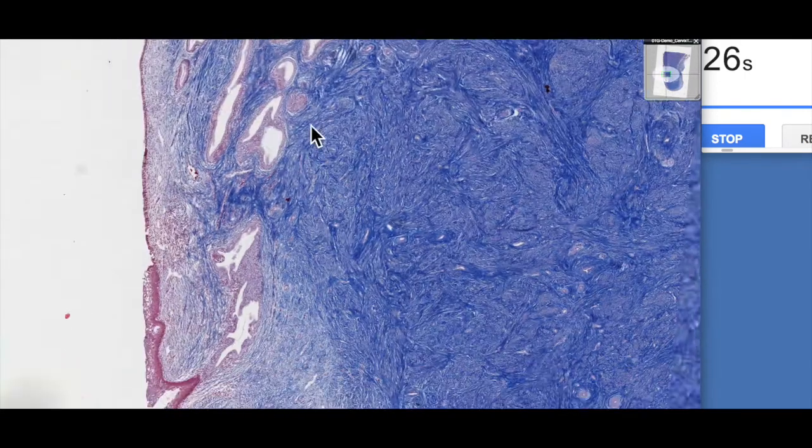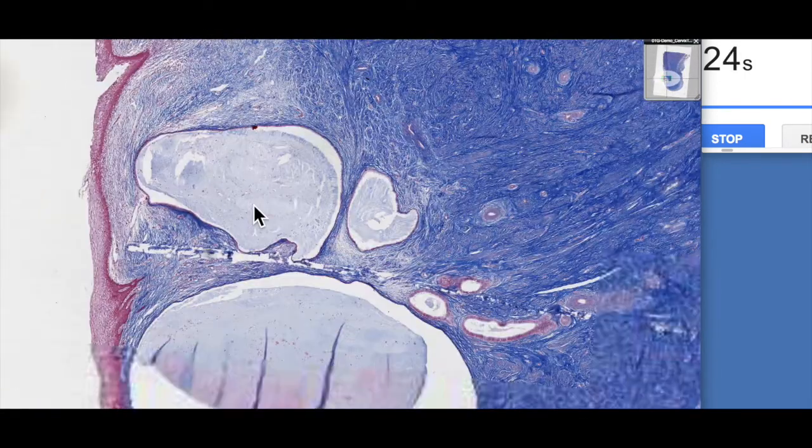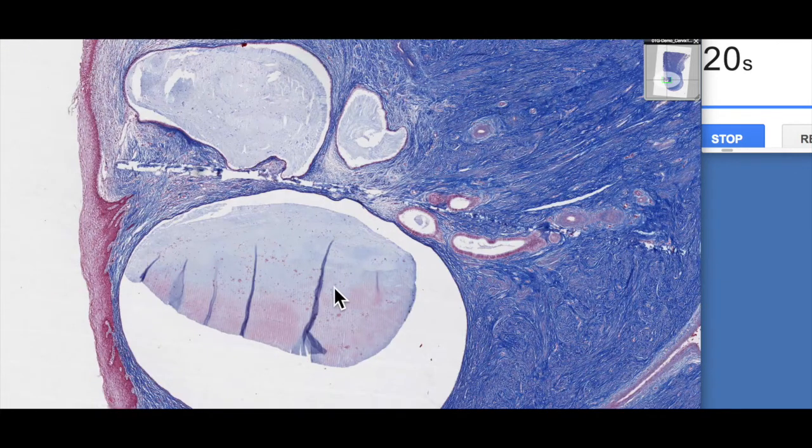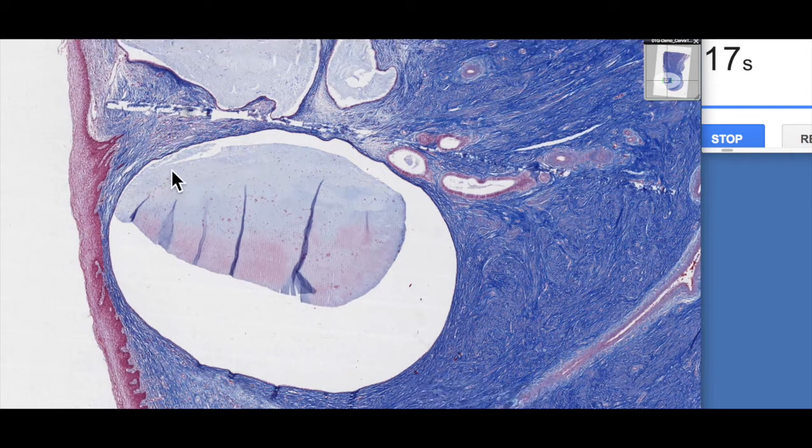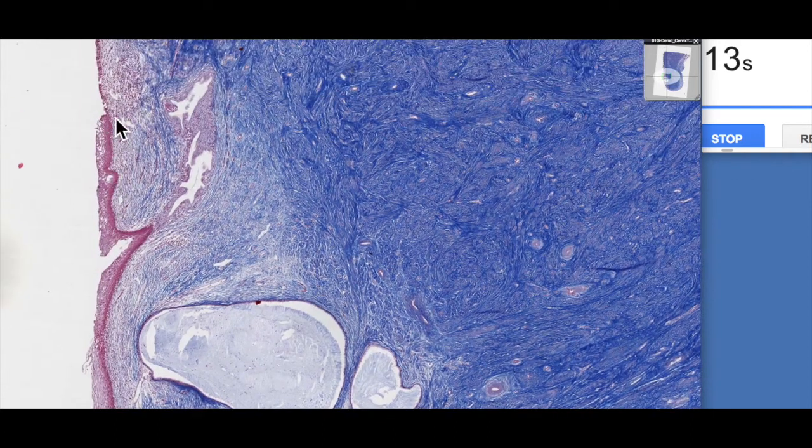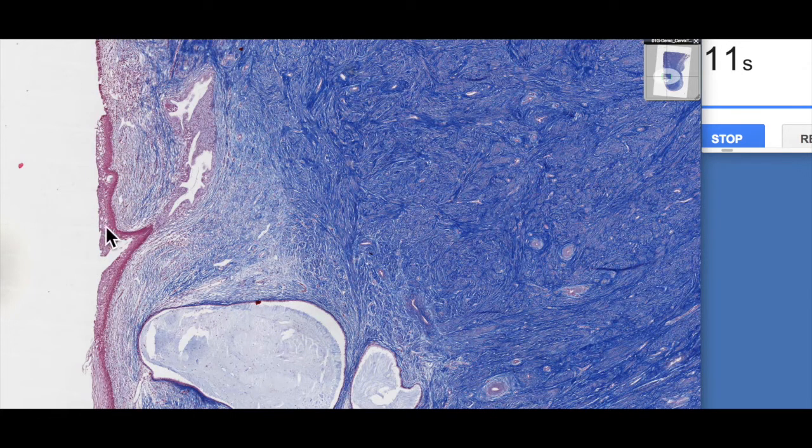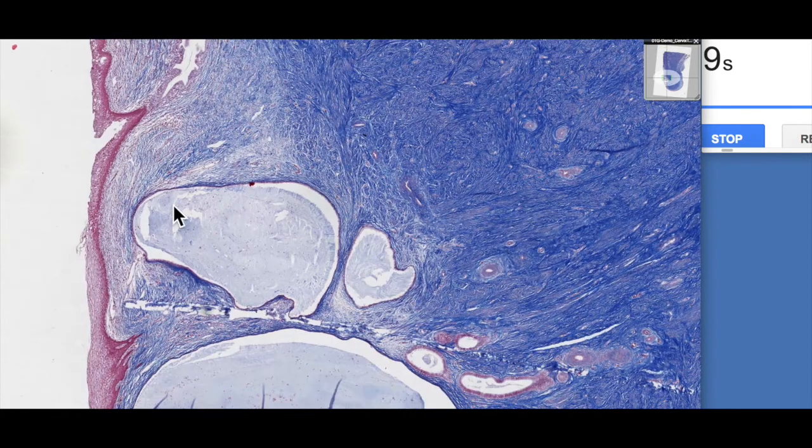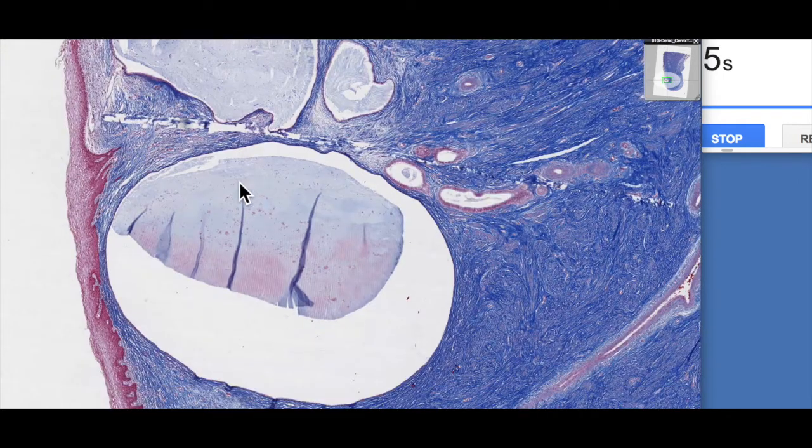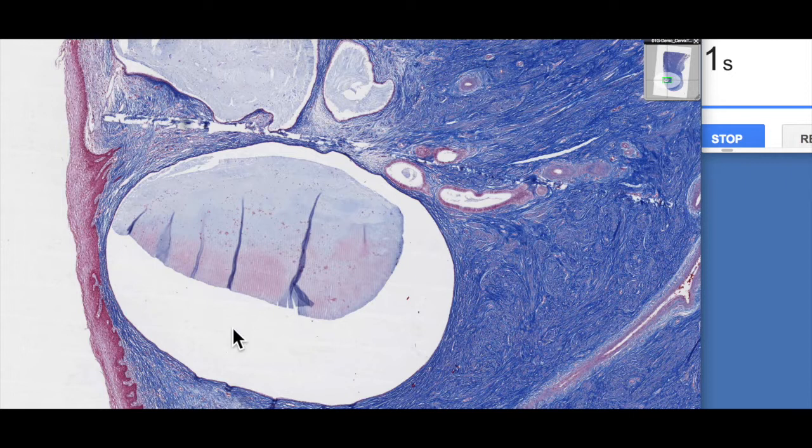Now these big follicle-like structures, these are known as nabothian follicles or cervical cysts. These actually were former endocervical glands that became trapped when the endocervix actually got transformed into this ectocervix-like structure. Unfortunately, we don't have time to talk about why that is, but they're a common feature of the cervix. So you can keep an eye out for those.